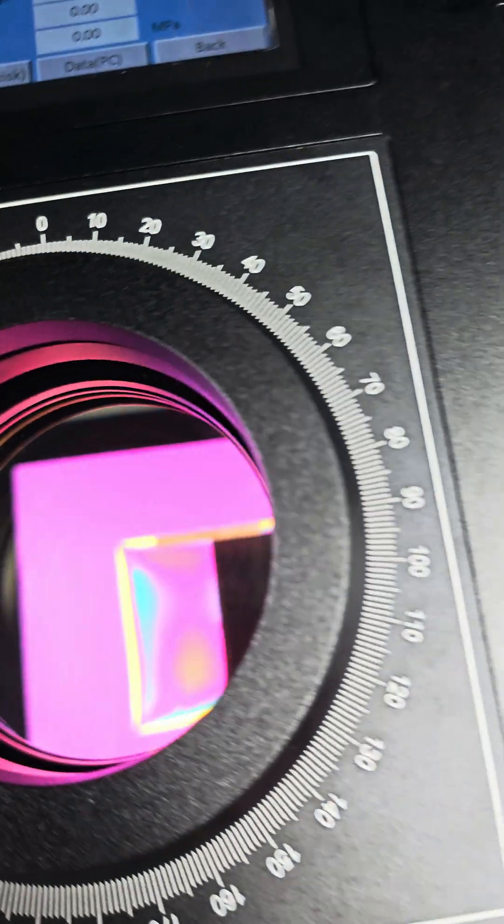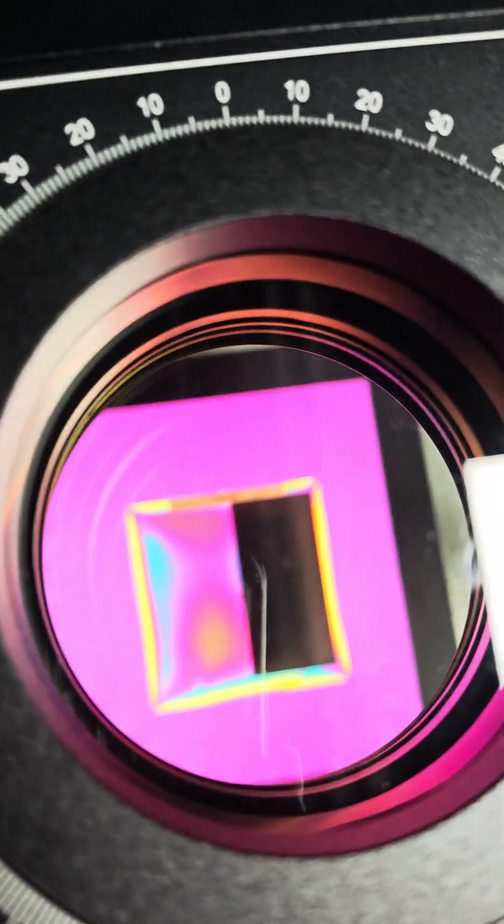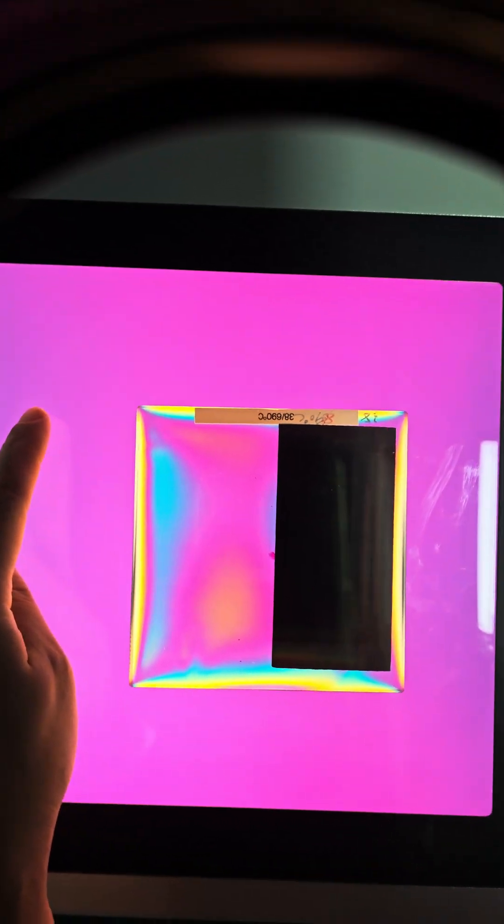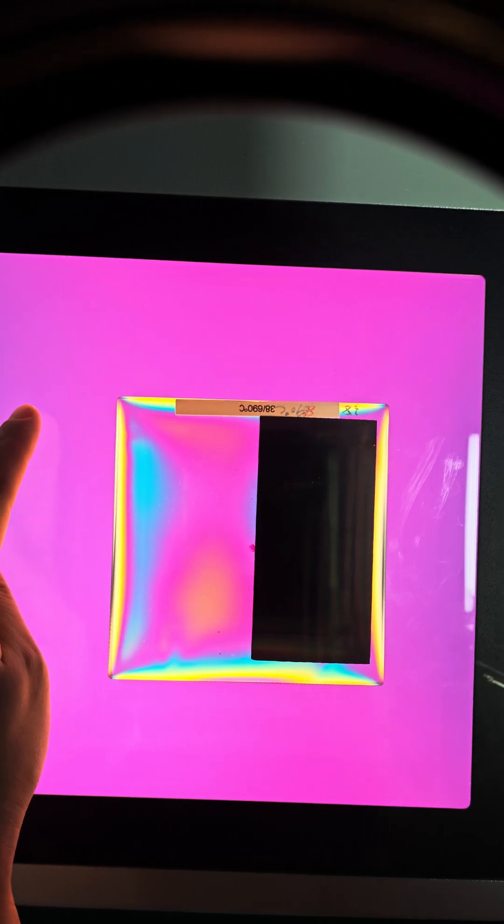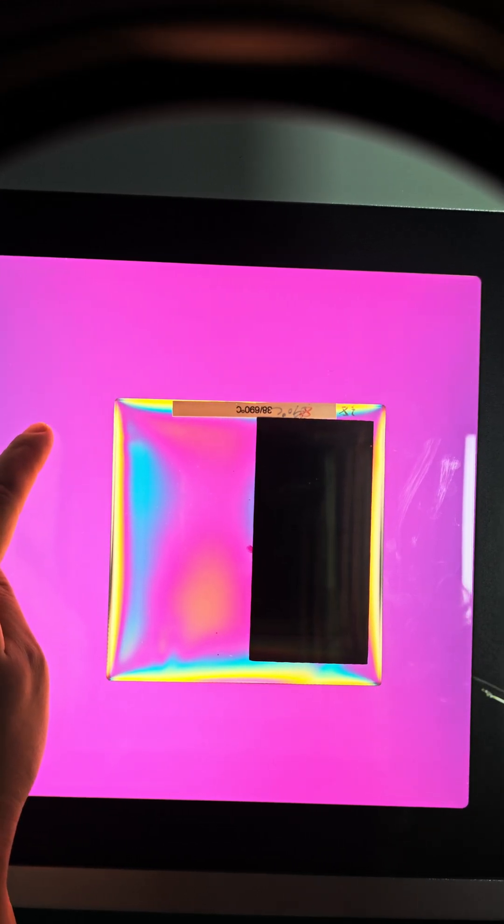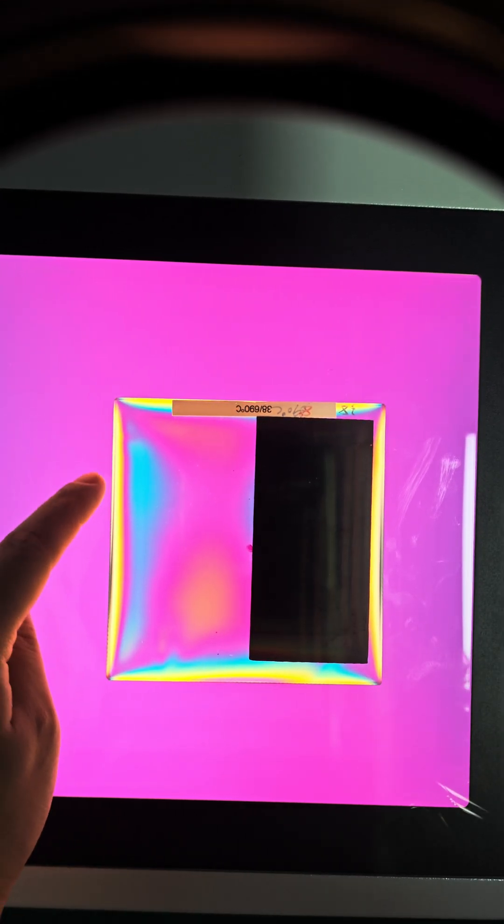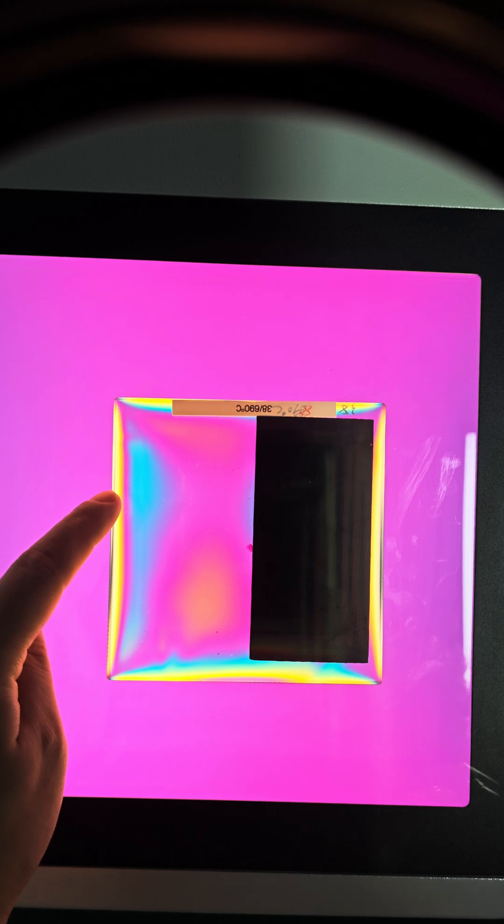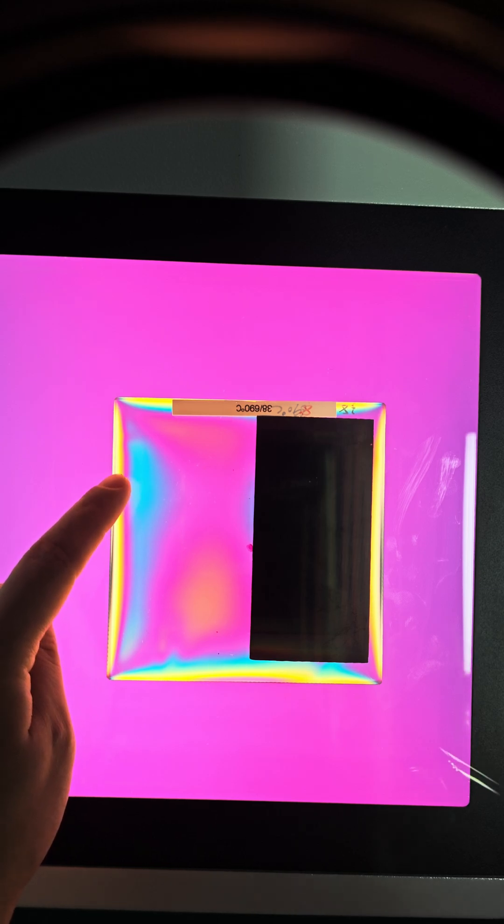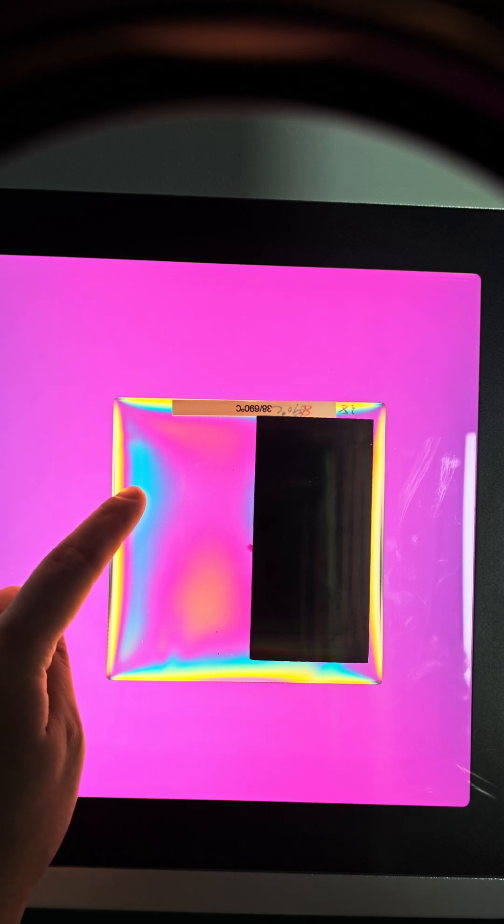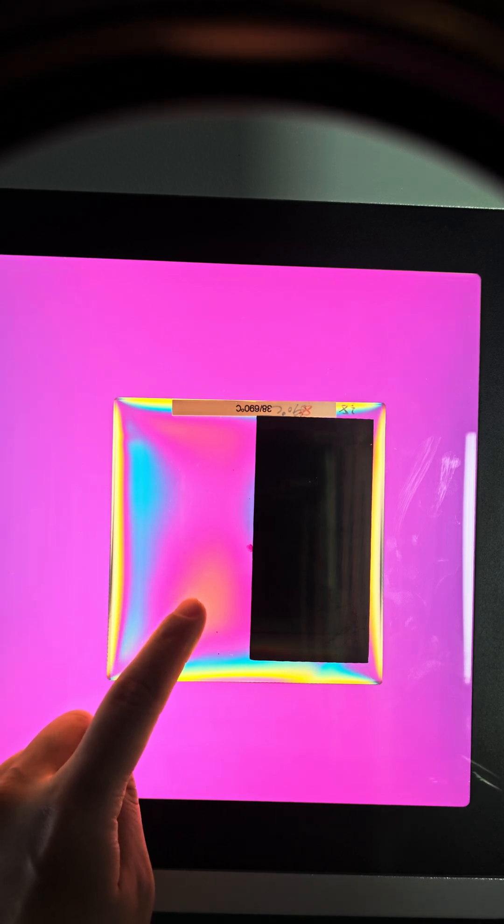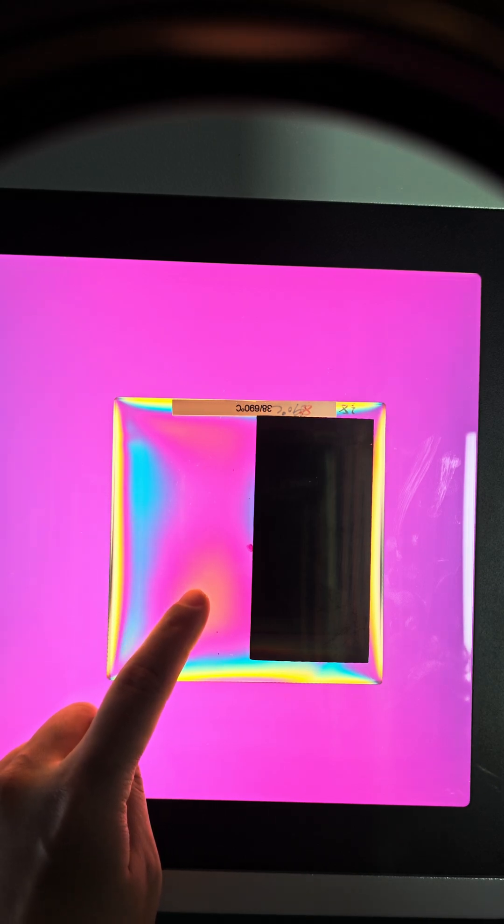We can see under this method, the background color appears orbiting and stress area displays different colors such as blue here and orange here.